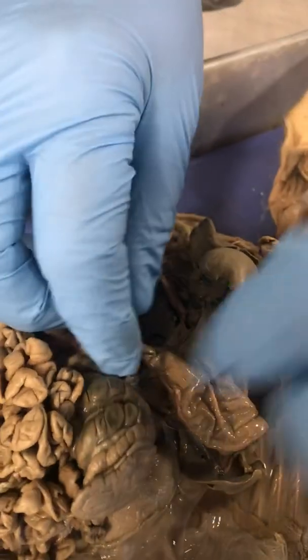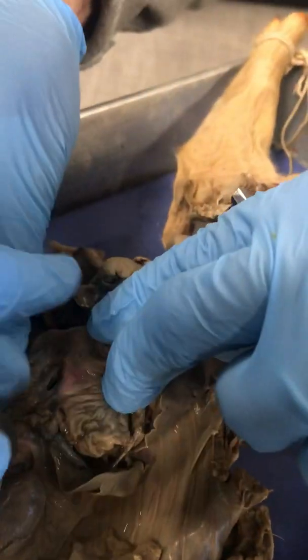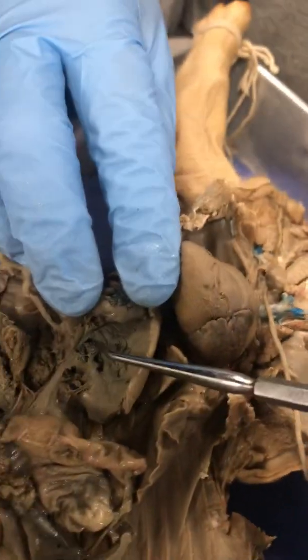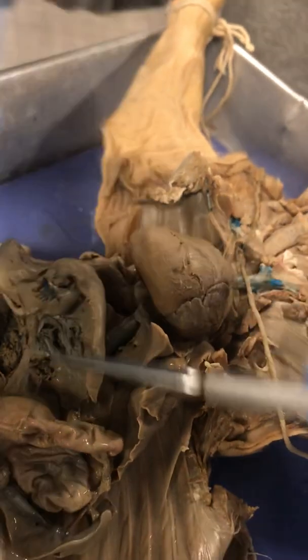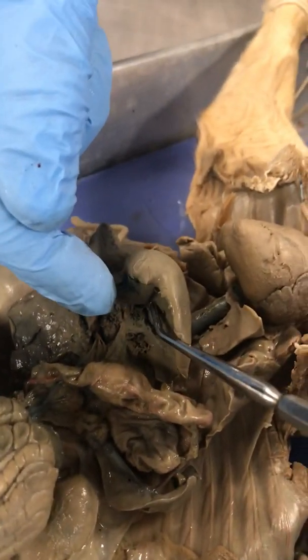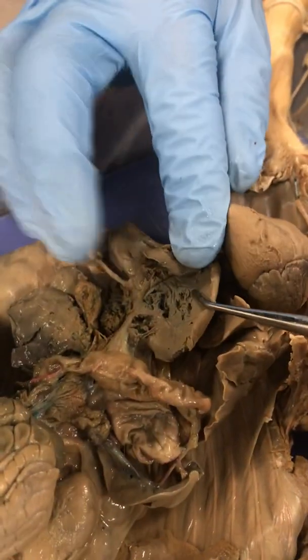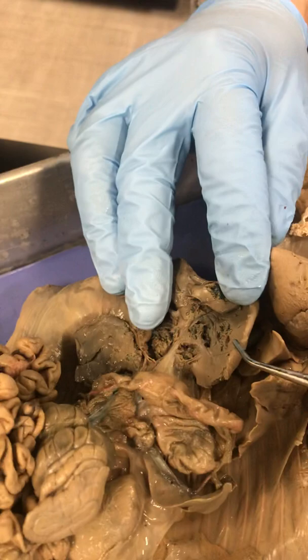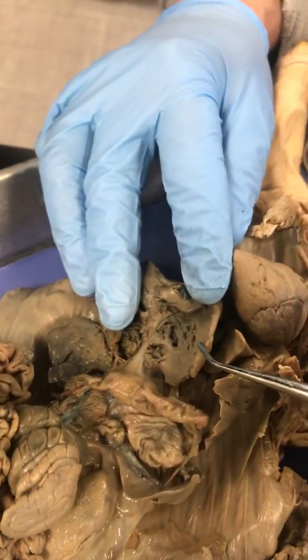And is this other thing right here, is that the hepatic? Yeah, well, it would be going up into the liver. And so you'd have to find the point of merging, convergence between all three of those structures. It's the common hepatic bile duct is what it's called.